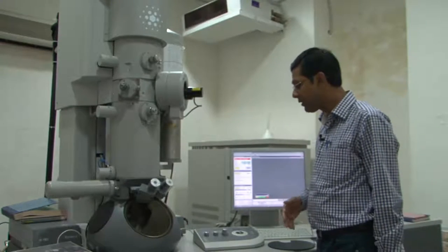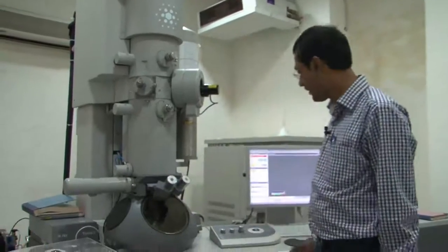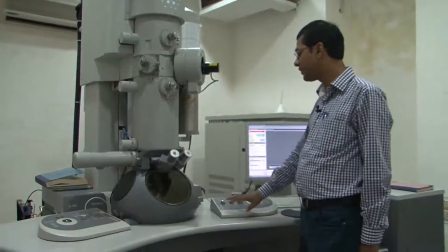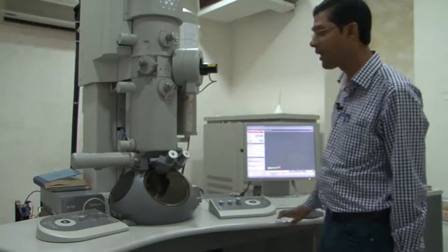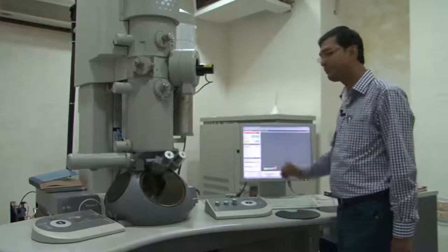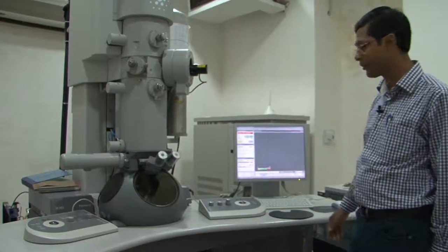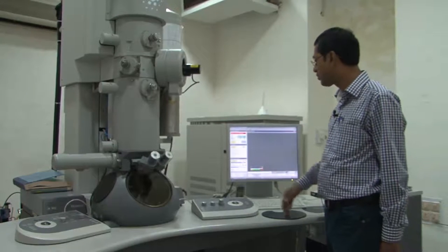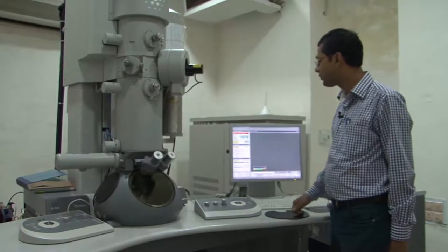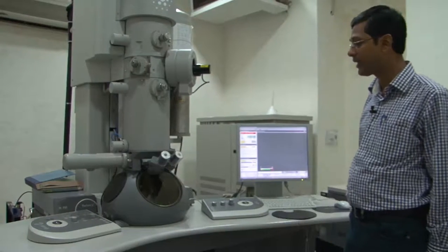And in normal modern day microscopes, the panels are like this. They're very small, in which you can have a very small number of buttons which allow us to control the microscope. And it is attached to a computer. The computer controls all the mechanisms in the microscope. In fact, microscope controls, like the valves, vacuum systems and the high tension, everything is controlled by that.